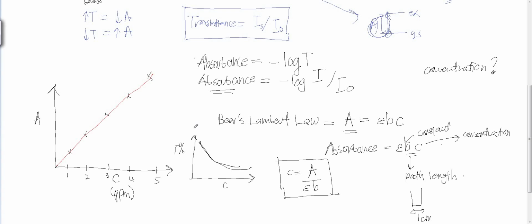So this is a correlation between the instrumentation, and then we can try to connect with the absorption, and then you have to know what is the Beer-Lambert law. Sometimes in the exam, dia akan tanya benda-benda macam ni yang mana you have to explain apa yang you tahulah. So please cuba faham instead of hafal.